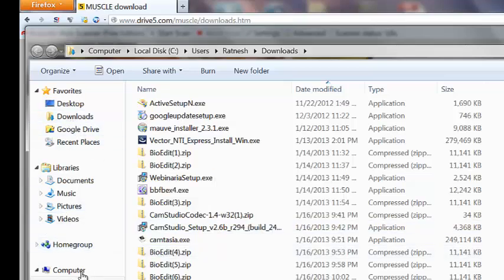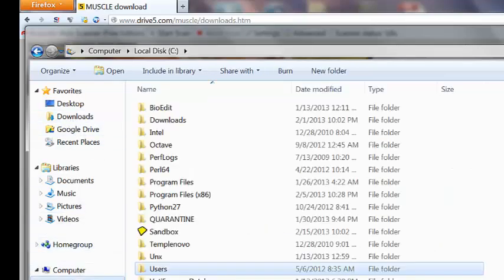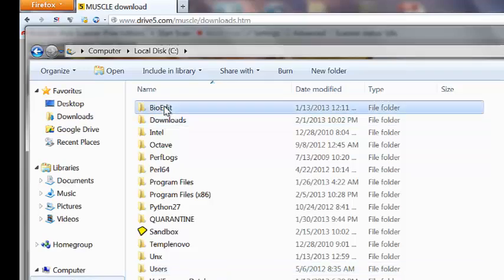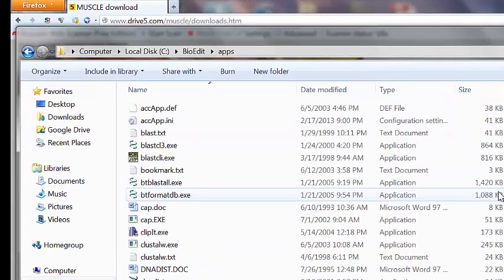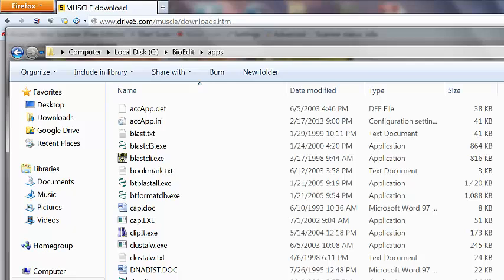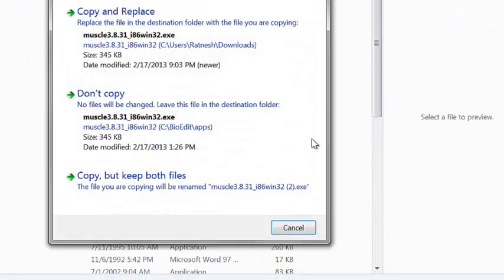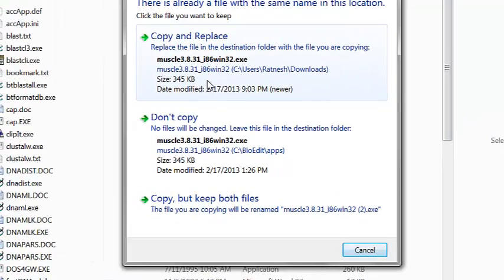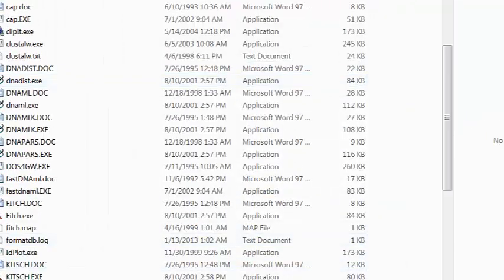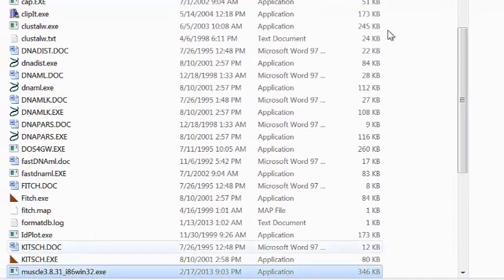Copy or cut the file from the Downloads folder and go to your BioEdit app folder, which is in the C drive under the BioEdit folder, then Apps. BioEdit keeps all application executable files here that are used during sequence analysis. Paste the MUSCLE executable there — it will ask to copy and replace, say yes.